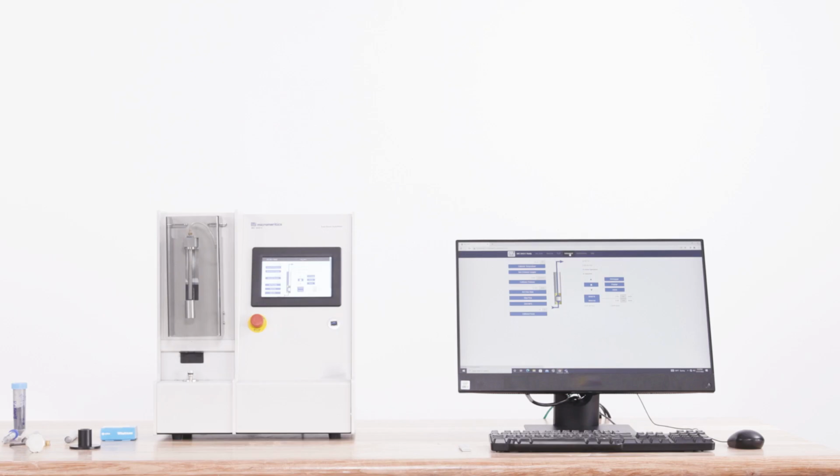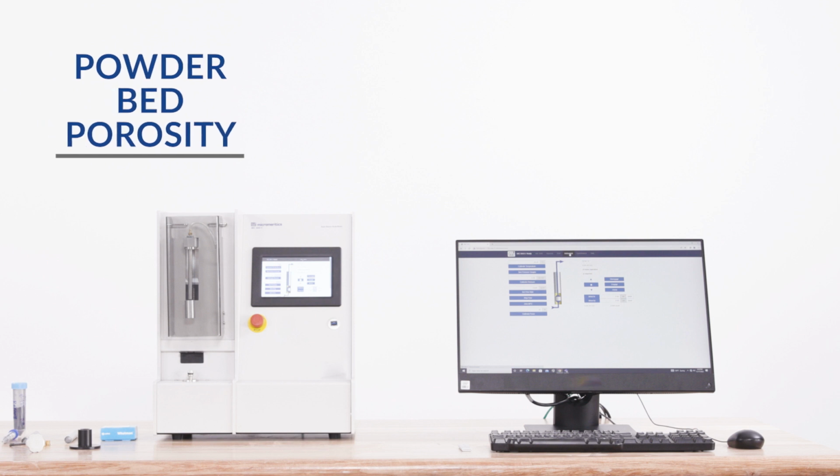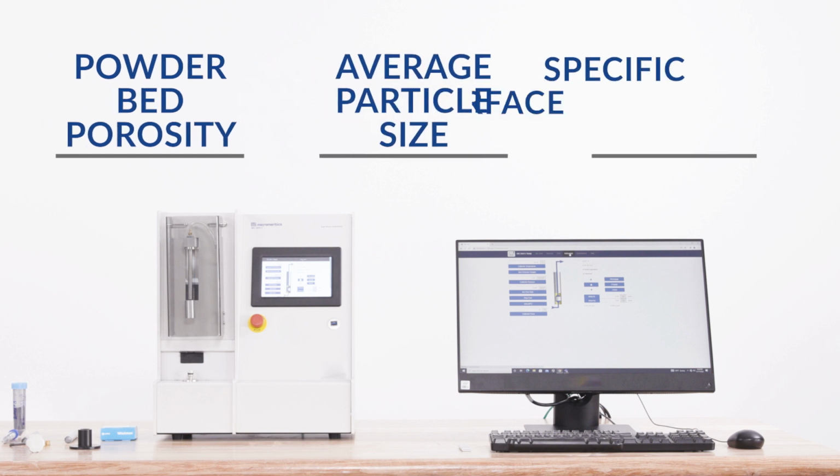Today we're going to be looking at the Micromeritics Sub-Sieve AutoSizer II, or SAS2, for the determination of accurate and reliable particle size data. The SAS2 is a fully automated version of the Fisher Sub-Sieve Sizer and determines powder bed porosity, average particle size, and specific surface area.